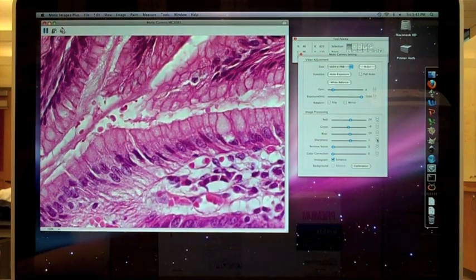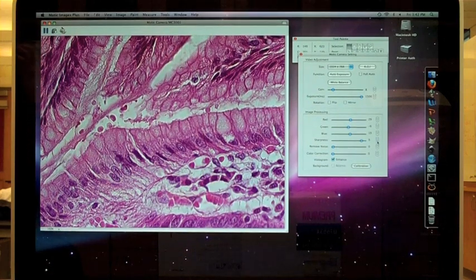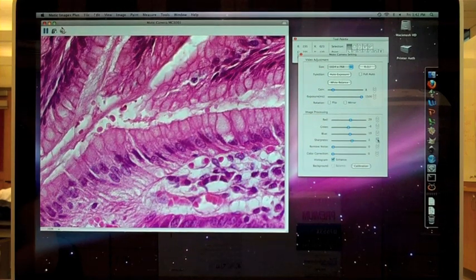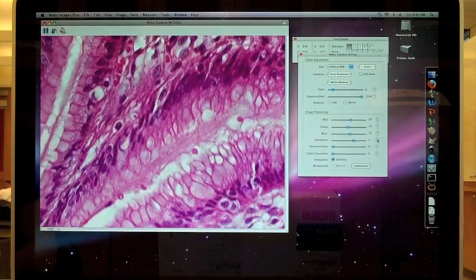You may want to make the image a little sharper than possible with the fine focus. You can use the sharpness slider to accomplish this. Keep in mind that you should never have to go above a sharpness of 6. Feel free to adjust the stage in order to find a better image.